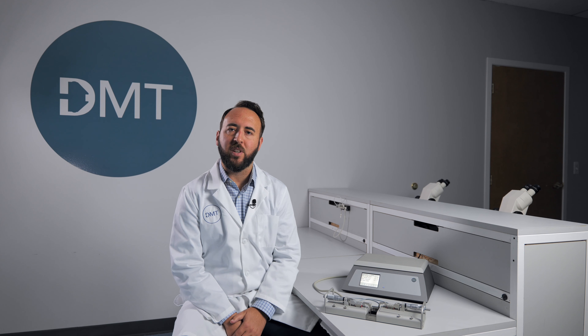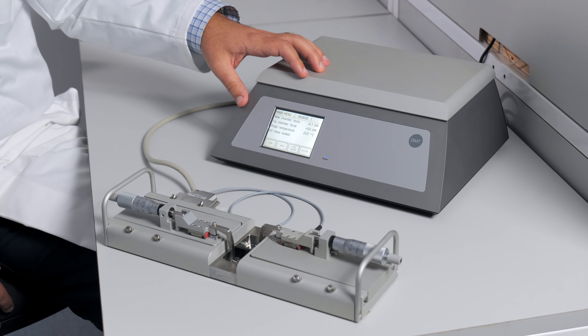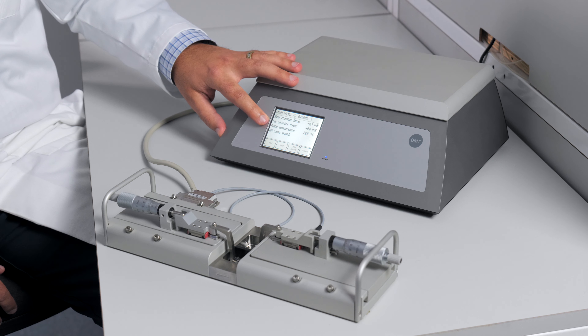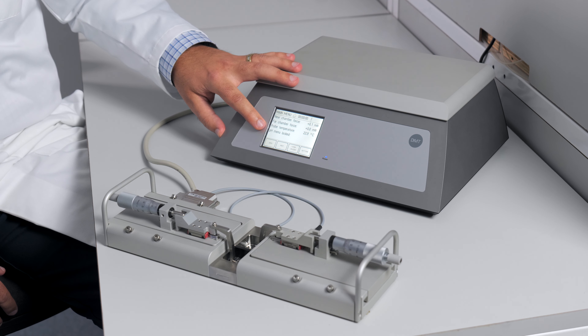The durability of the build and materials allow for heavy use in reproducible experiments. We'll begin with the interface. When looking at the main screen of the interface, you will see the force reading from each chamber, the probe temperature reading, as well as the pH reading if the probe is equipped.